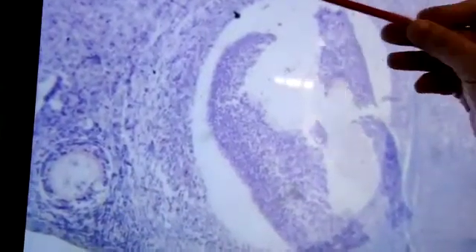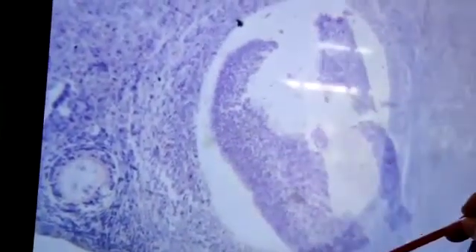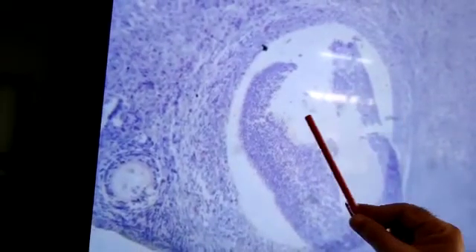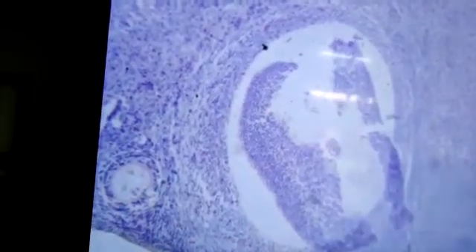This is the mature Graafian follicle which is having the ovum. This is the complete follicle, and this is the ovum. After some time it will burst and the ovum will be released out. Thank you.